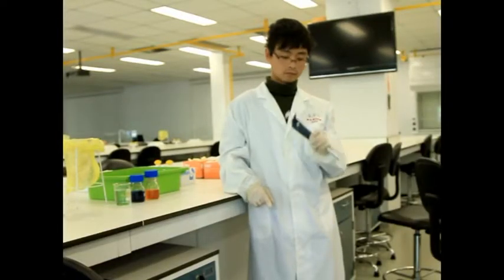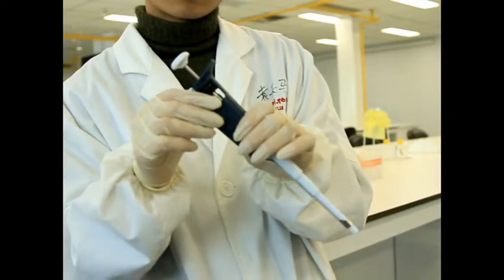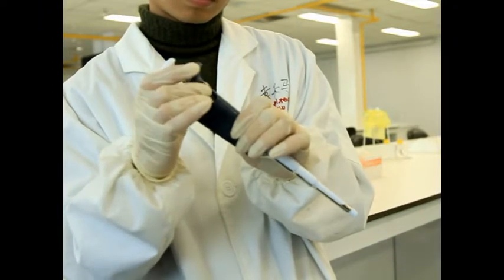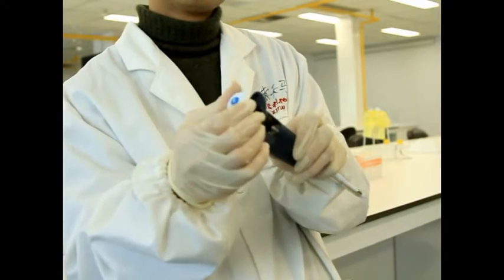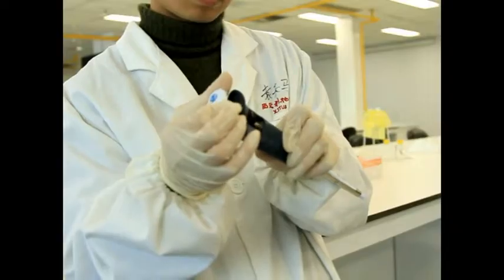To set the volume of liquid to be dispensed, adjust the volume knob. Hold the body of the pipette in one hand and use the other hand to rotate the thumb wheel or the push button volume setting. Always finish the setting with a brief clockwise motion to minimize the error caused by mechanical backlash.